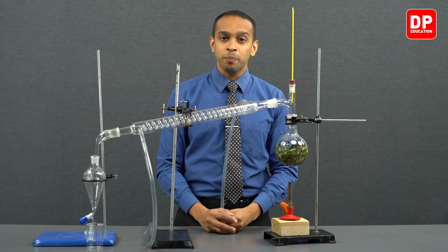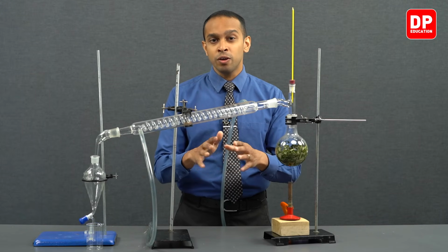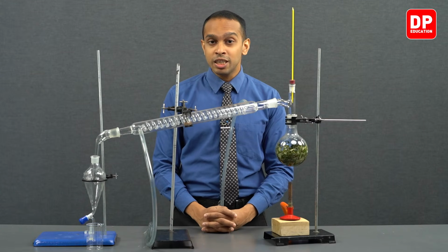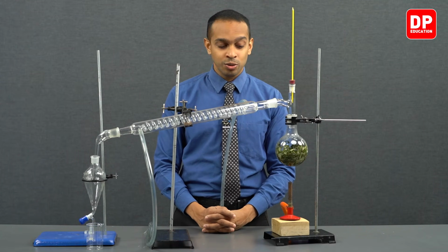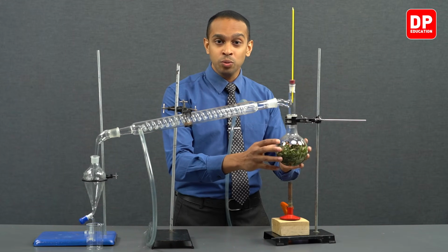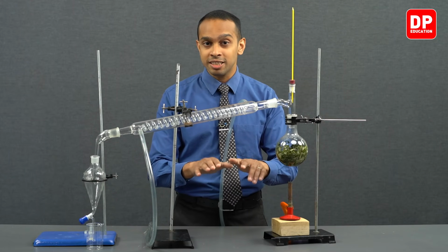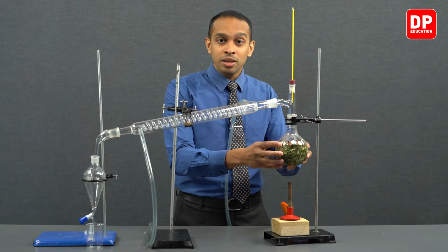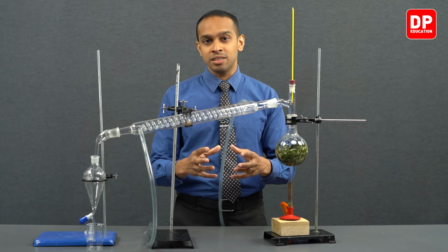So when you have two immiscible liquids mixed together, when you're trying to boil this mixture, we have observed that the boiling temperature of this mixture will be lower than both of the individual boiling temperatures of each component. So that is why we see that this mixture will start to boil at a lower temperature than 100 degrees Celsius.